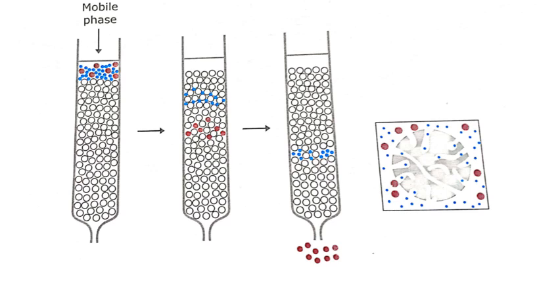Why? Because, as I was saying before, the brown molecules are larger, so the beads cannot accommodate these brown molecules, but the beads can accommodate the blue molecules. So the blue molecules are moving slower, and in the third picture you can see that the brown molecules are coming out or eluting faster, but the blue molecules are still moving and have not eluted yet.